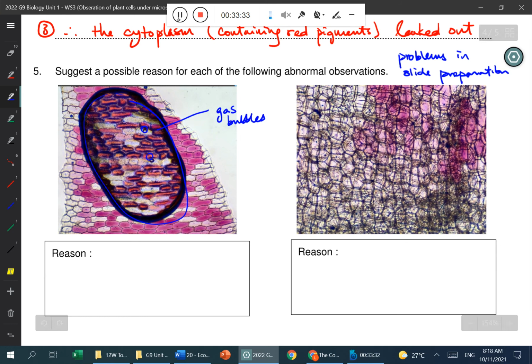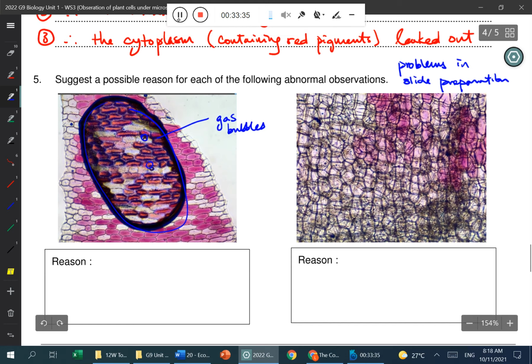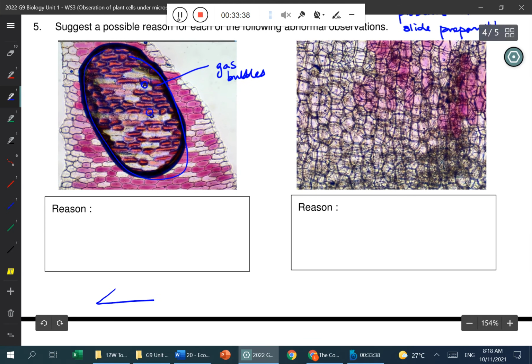They are not naturally present in the epidermis. Rather, if you remember, there is a step where you have a glass slide and a piece of red onion epidermis, and you put it on a drop of water. Do you remember? And then you cover it up with the cover slide, by lowering the cover slide slowly.